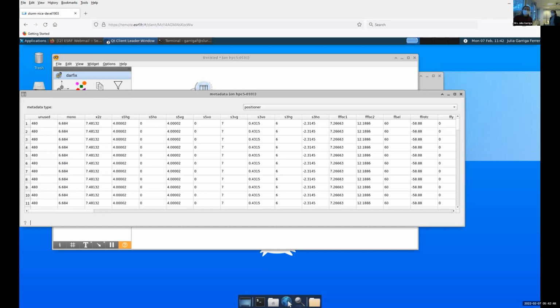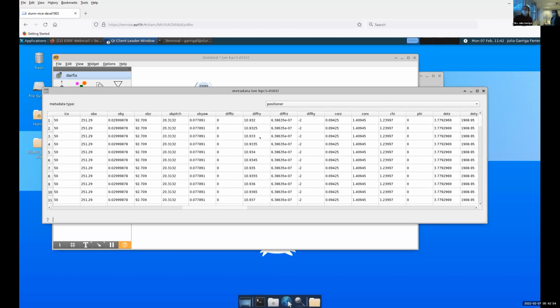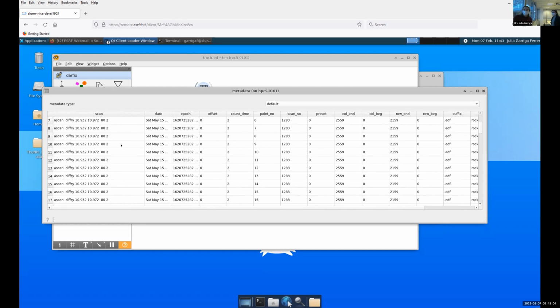Although it's pretty much the same as before, you can see it. You can go to the moving motor. This is also a different scan. So exactly, if I go to default, this actually has, we'll see it now, we see that it's an A scan with 81 steps.